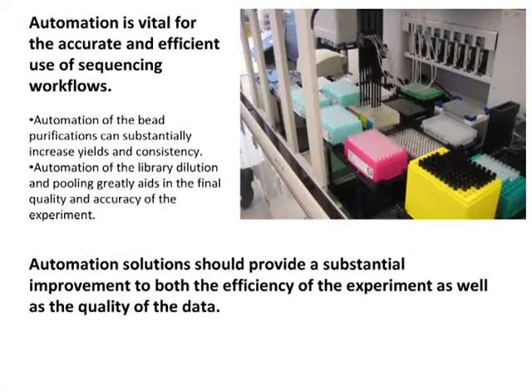So why do we automate? Well, it's fairly simple, and I think probably well appreciated by the group. We really use it for accurate and efficient use of the sequencing workflows. We've compared the off-deck as well as on-deck results, and for the same technician doing the off-deck and on-deck, the results are fairly indistinguishable. That same thing applies across multiple technicians.